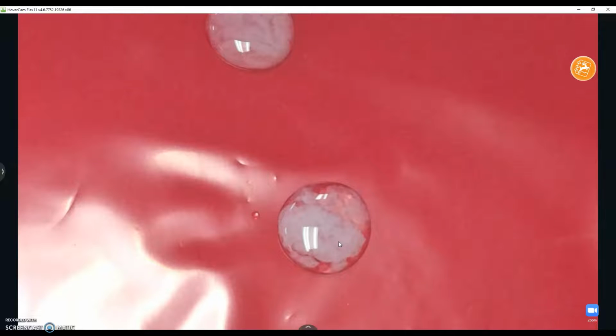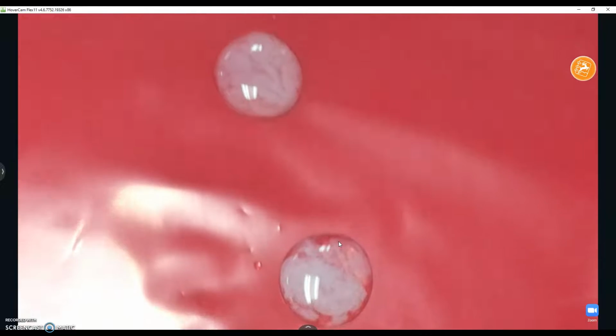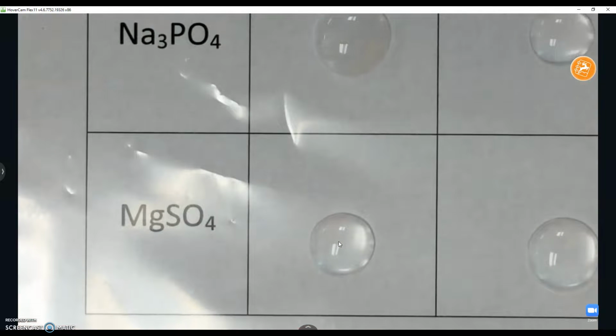Precipitates are tiny, tiny, tiny solid particles. They're not going to be overwhelming. It's not like you're going to suddenly create a magic crystal or something. It's actually really small. I told them in class to think about it like baby powder in water, how small and fine baby powder is.